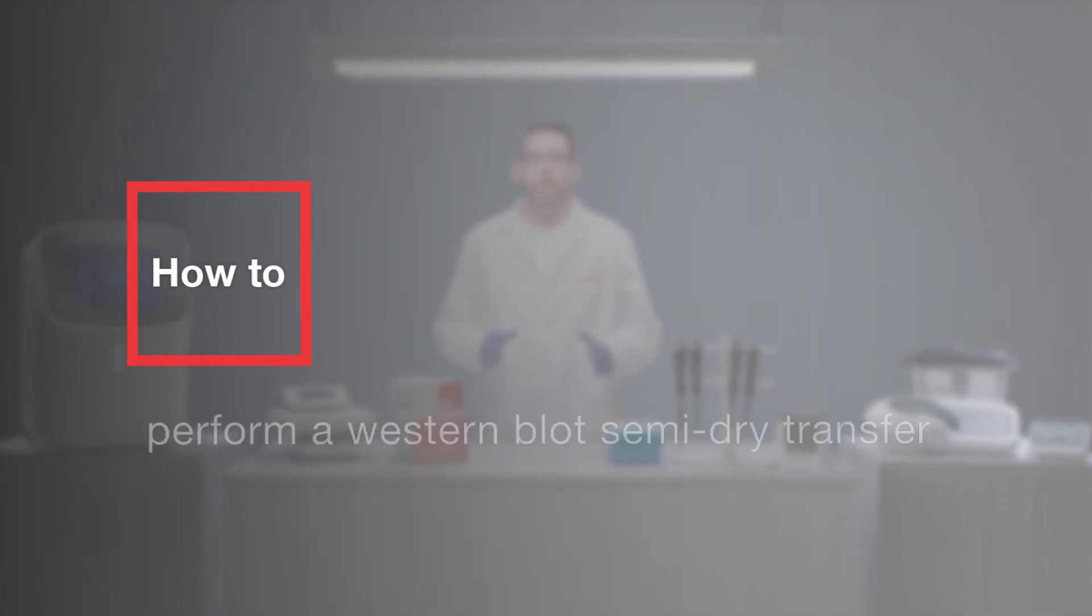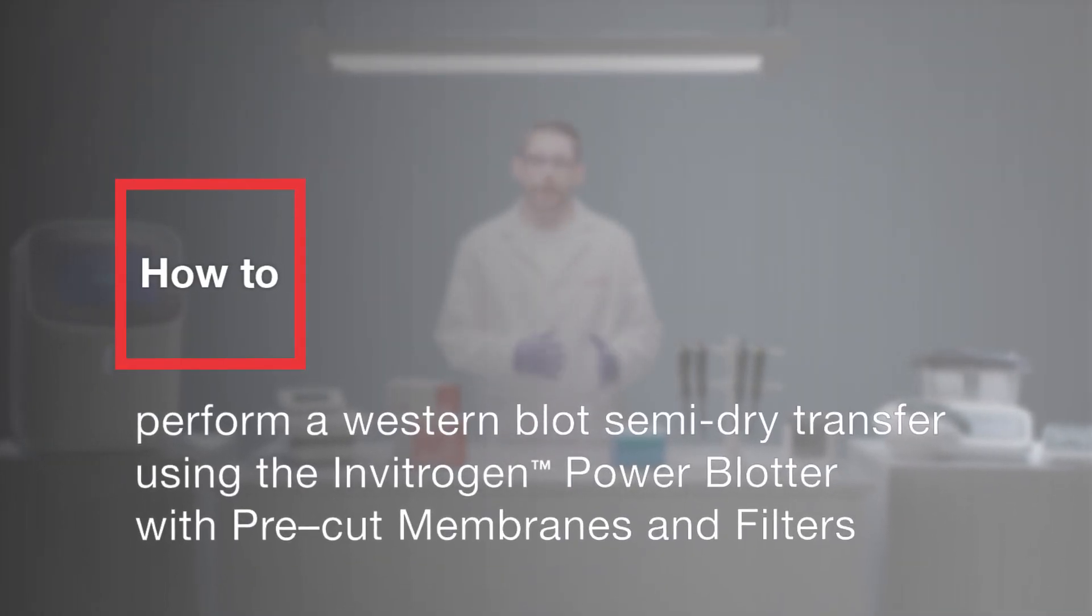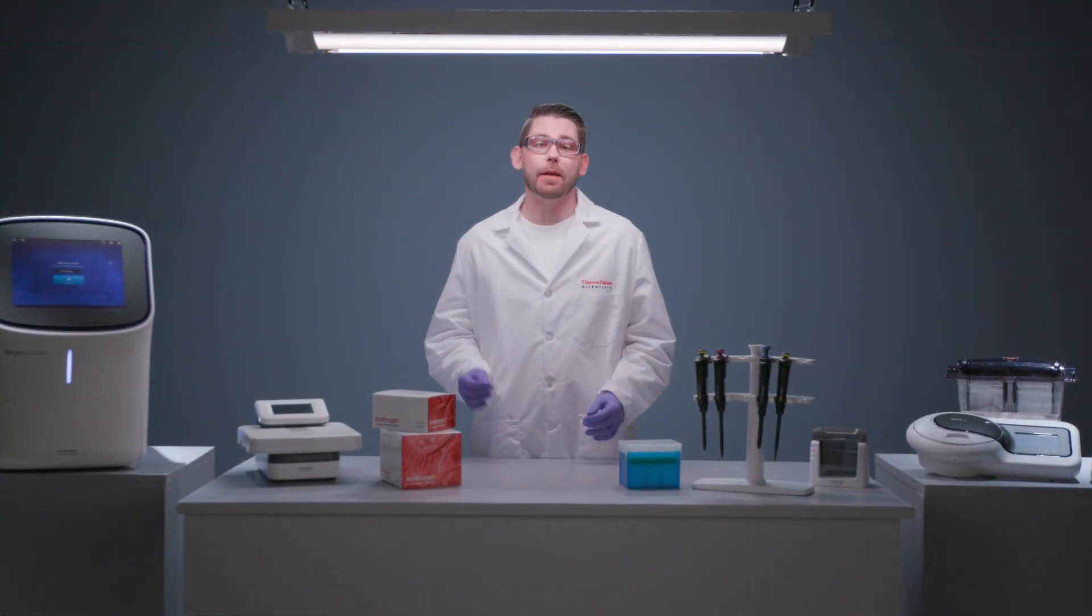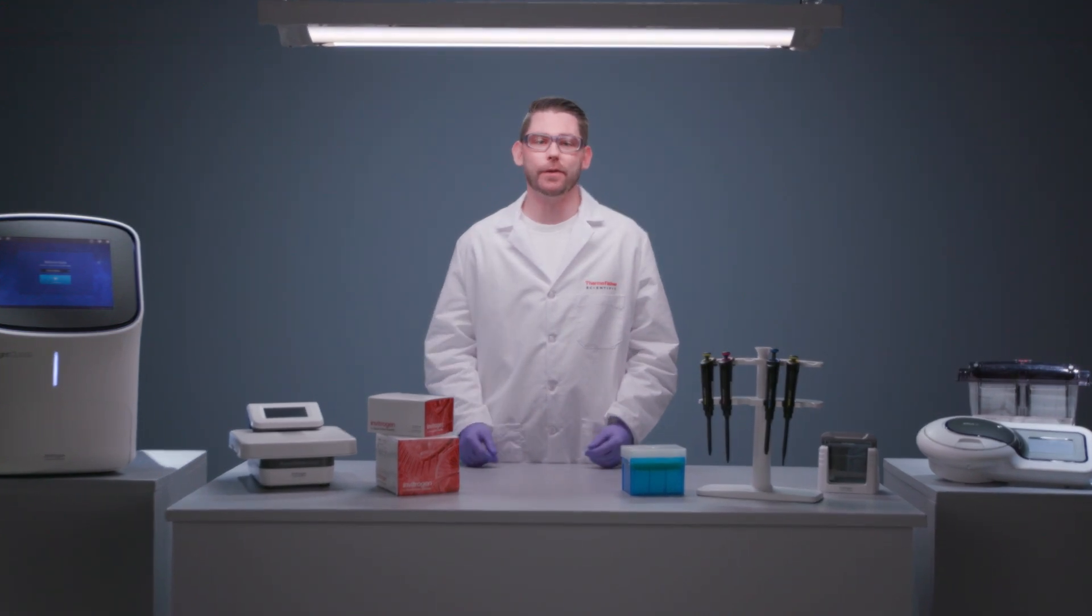In this video, you'll learn how to transfer proteins from polyacrylamide gels to membranes using the Invitrogen Power Blotter with our pre-cut membranes and filters in Power Blotter One-Step Transfer Buffer.